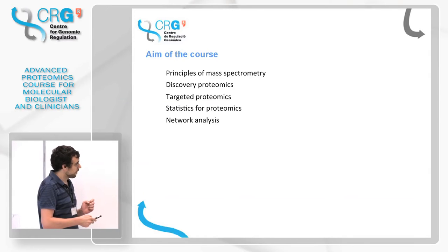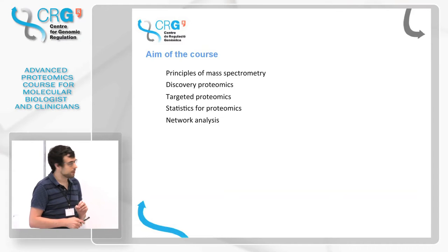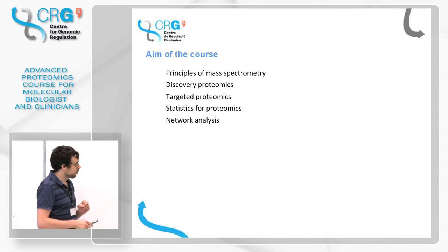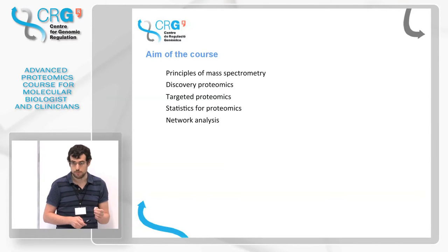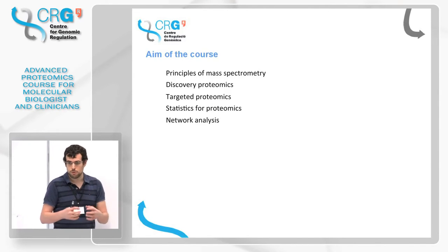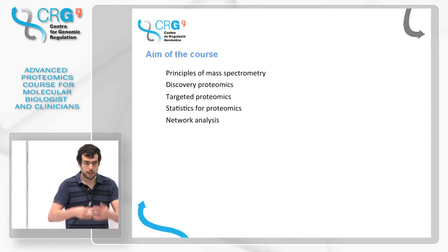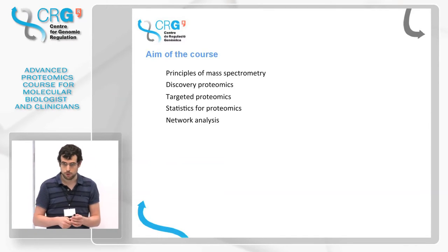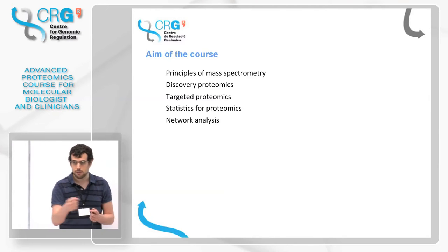Then we will also dedicate some time to targeted proteomics, so how to actually analyze our targets of interest. Another important thing is how to analyze our data and how to plan our experiments, and we will dedicate some time to this too. And the last goal of the course is to introduce you to a network analysis approach on how to get the most information out of your data, right? Having this global view of the proteome, and not analyzing proteins by themselves one at a time.